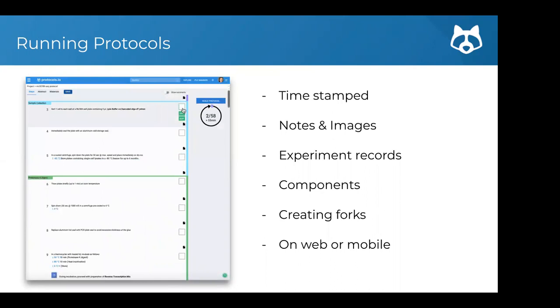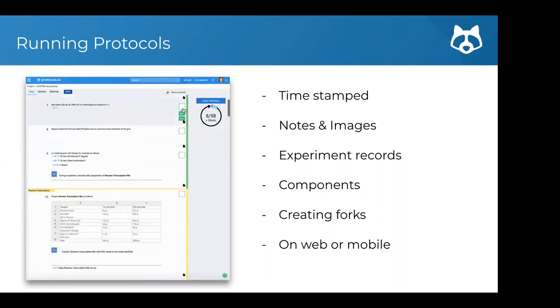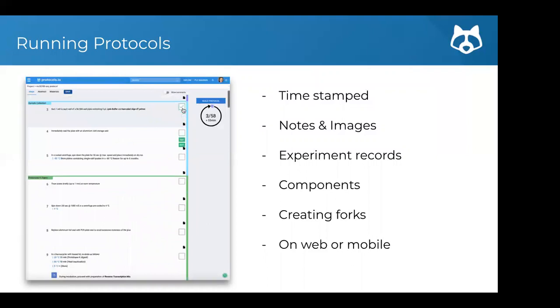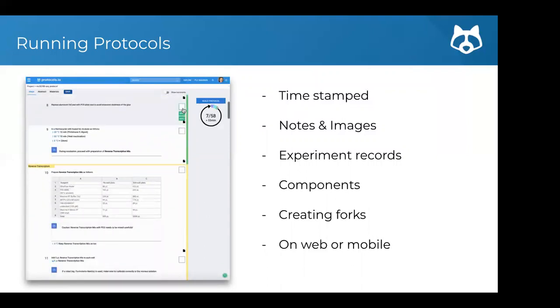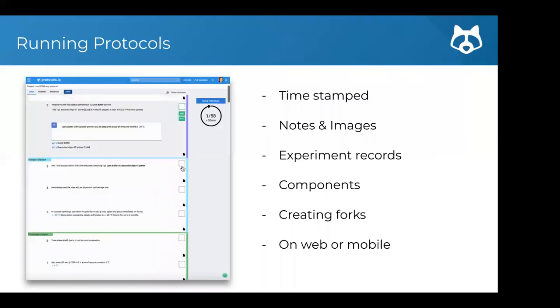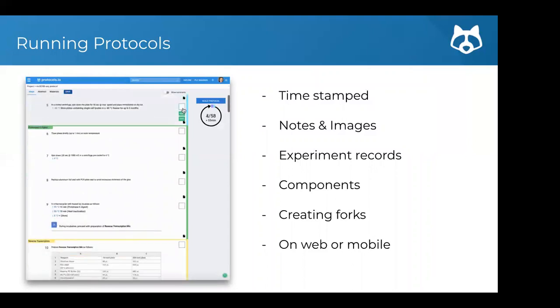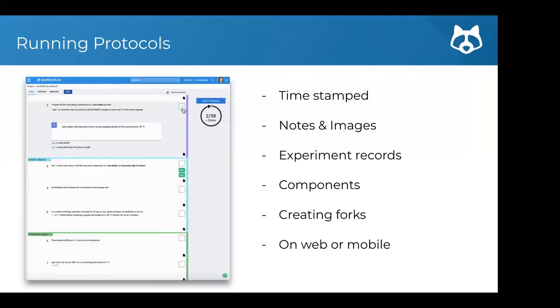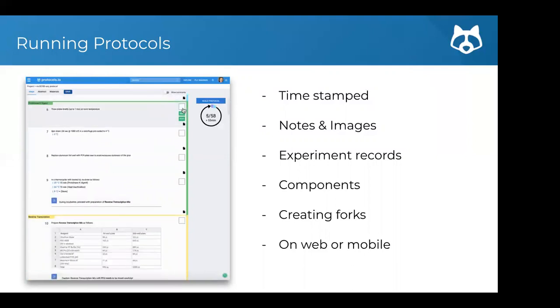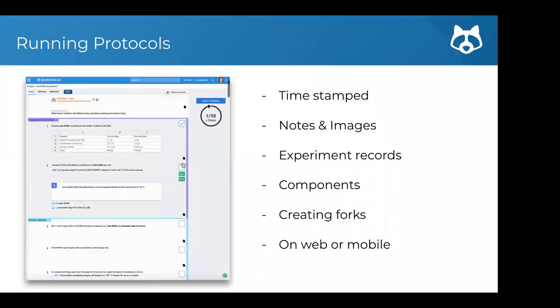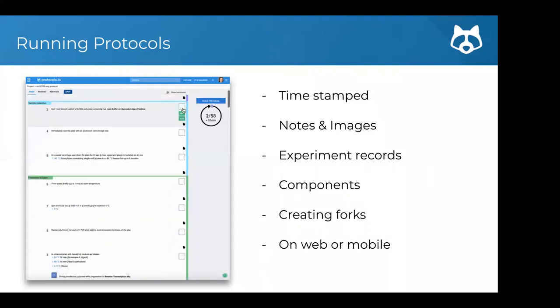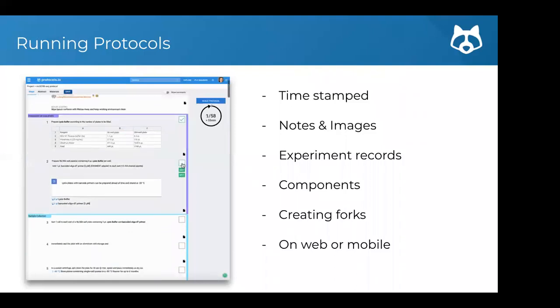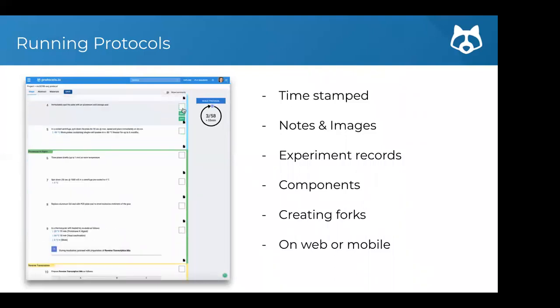For running protocols: using our run functionality, it's really just a checklist of all the individual steps. You can check off steps, skip steps, edit steps, and everything gets timestamped. You can add notes and images to individual steps. The components make the protocol scalable and you have timers that start. This running functionality can be done from the web or from mobile devices — we have free Android and iOS apps you can use while in the lab. Once done, you get an experiment record to share with your team.